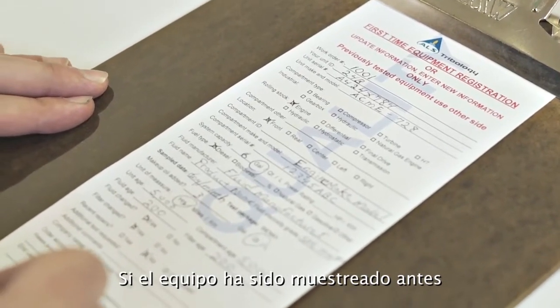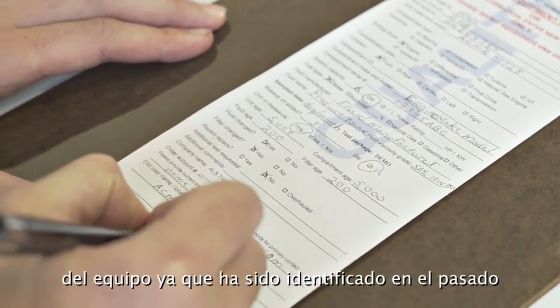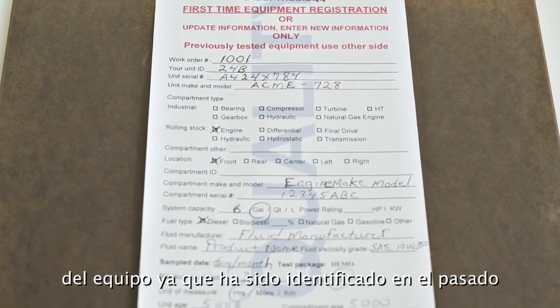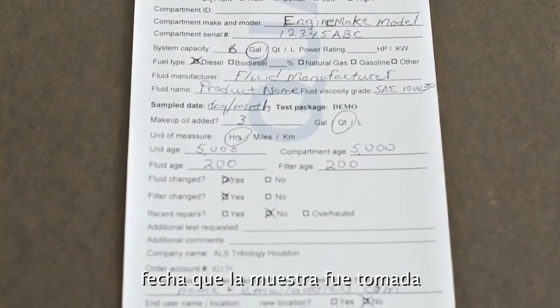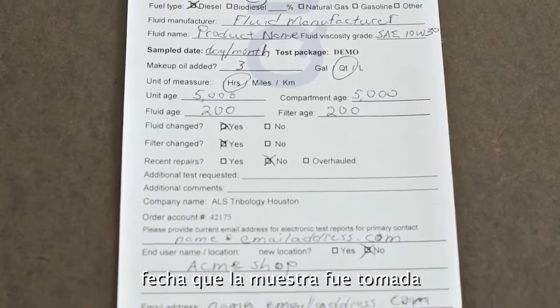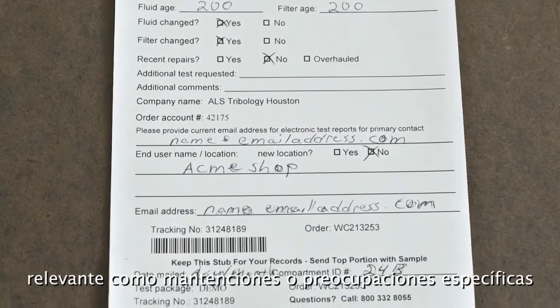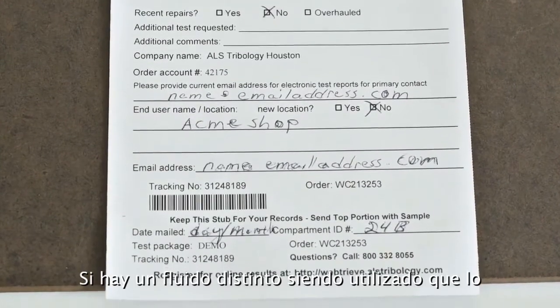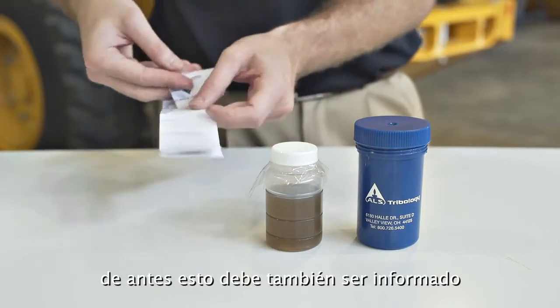If the equipment has been sampled before, it is only necessary to provide the equipment identification as it has been identified in the past, or use the Laboratory Unique Identification Number, UIN, age on the lubricant and equipment sampled, date the sample was taken, filter change, and any relevant notes, such as maintenance or specific concerns. If there is a different fluid product being used than in the past, this needs to be indicated also.